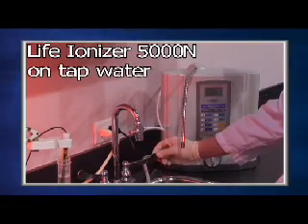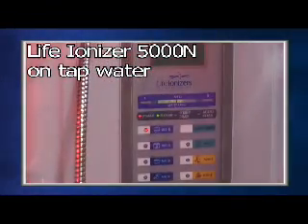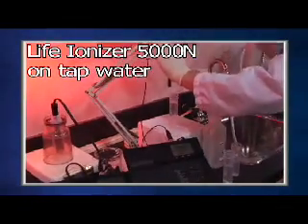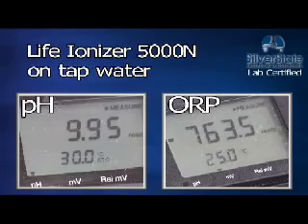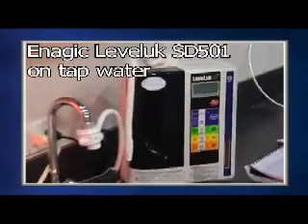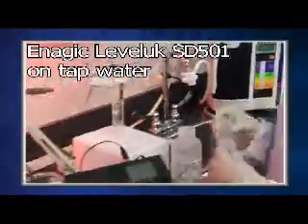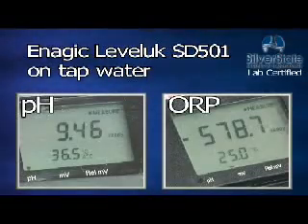Next is the LIFE Ionizer 5000N. The LIFE Ionizer has a pH of 9.95 and an ORP of minus 763.5. And lastly is the Enagic Leveluk SD501. The Enagic pH tested at 9.46 with an ORP of minus 578.7.